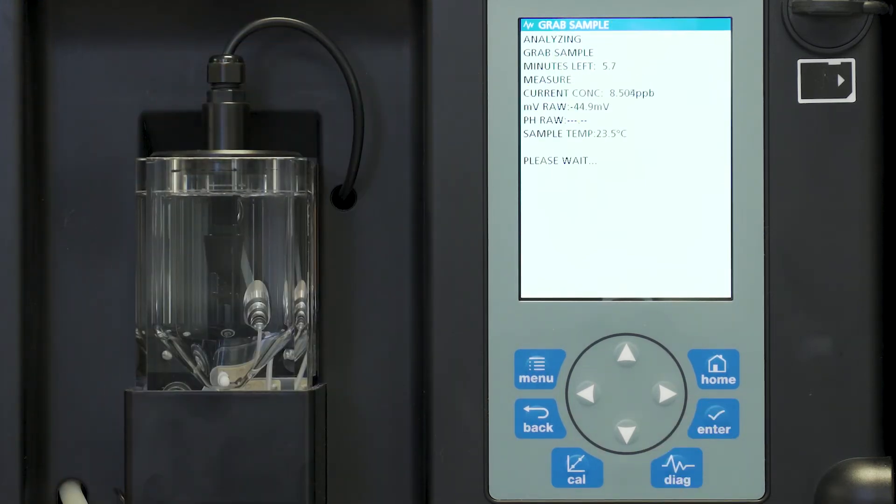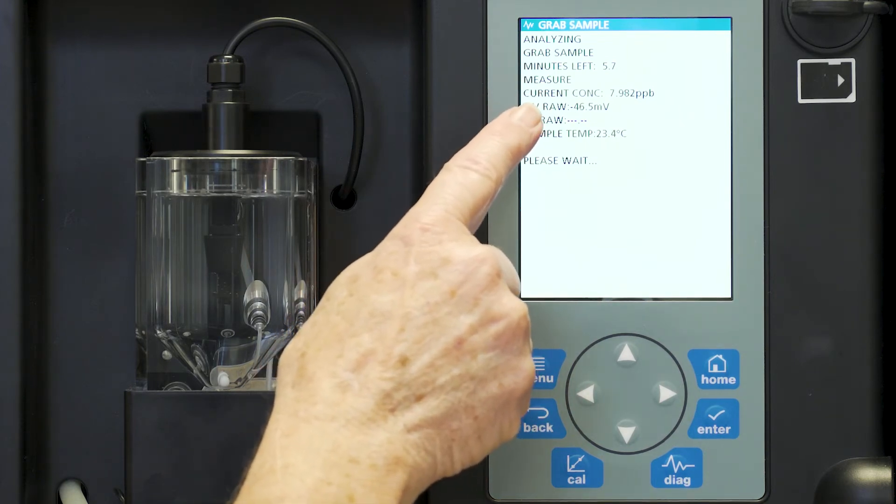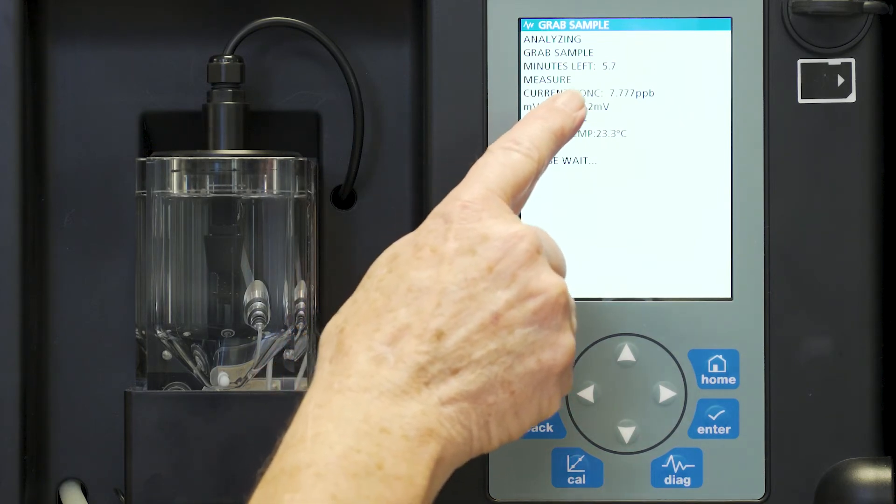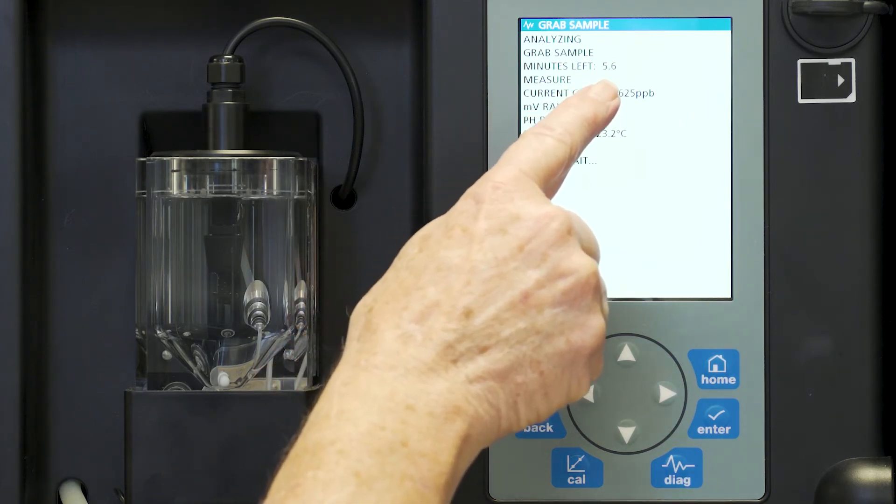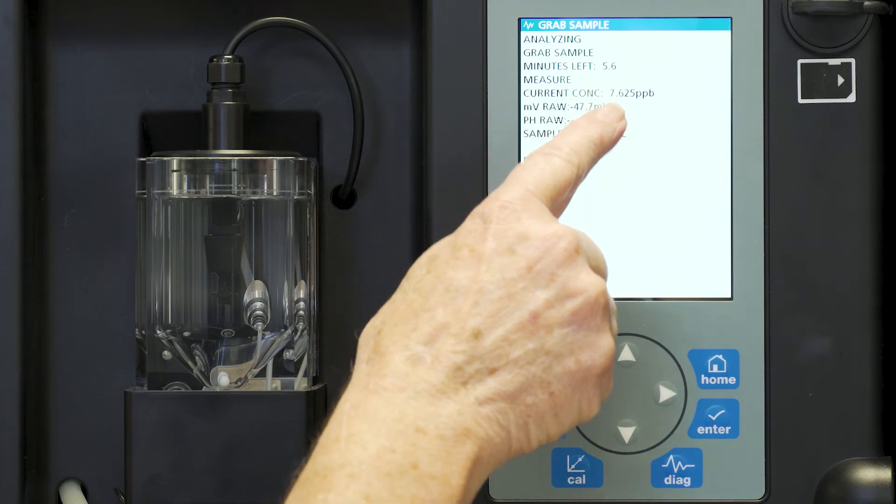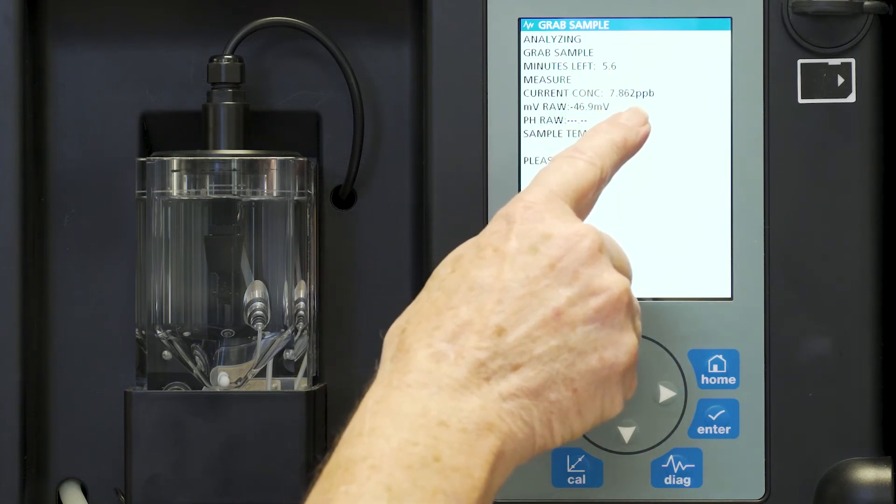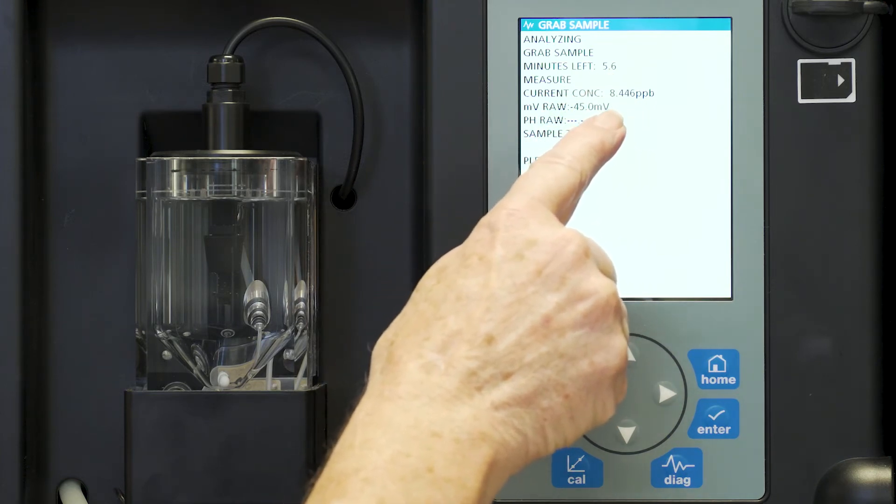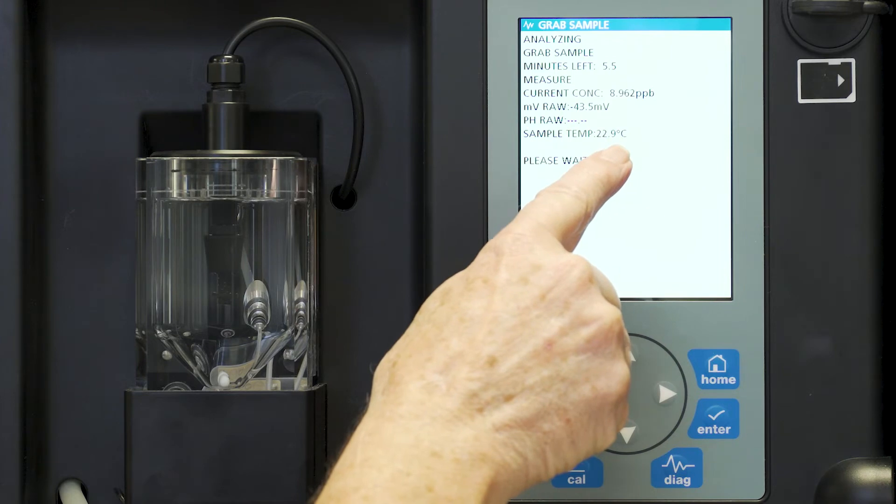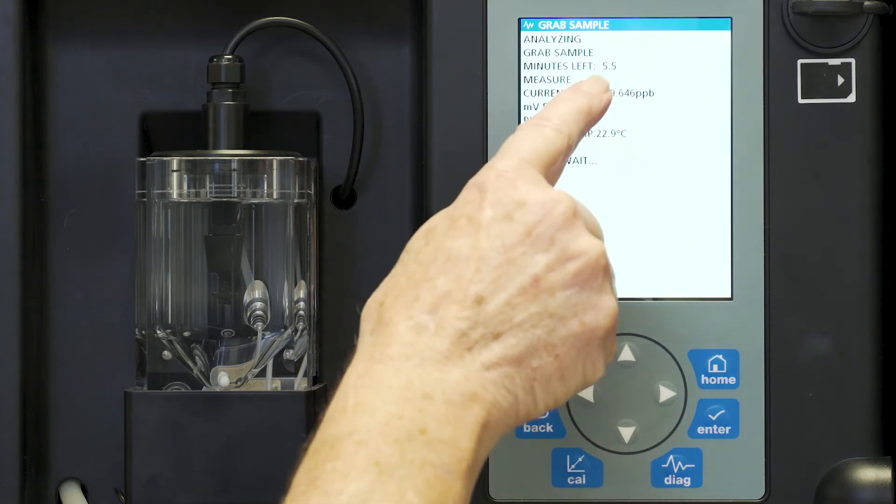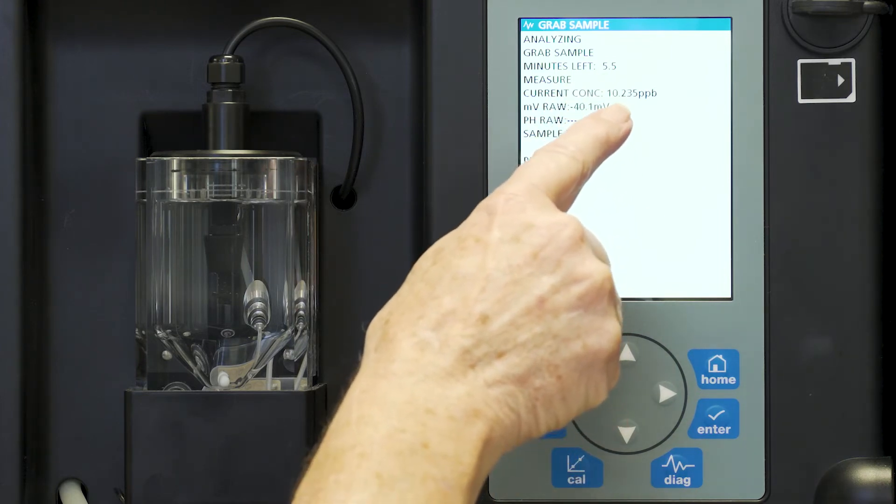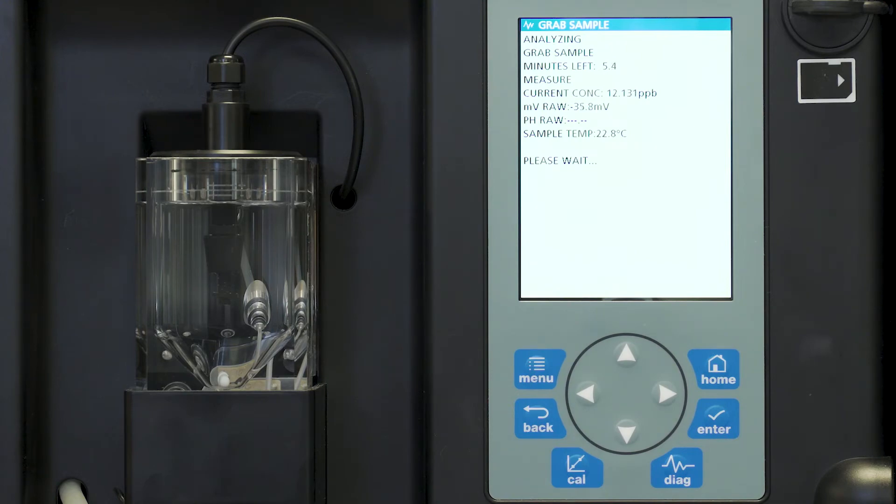We're now getting a live reading. It shows us there's 5.7 minutes left to read the sample but it is showing our current concentration and our raw millivolt reading and sample temperature. At the end of the five minutes it will give us our locked in reading of what our actual grab sample measurement was.